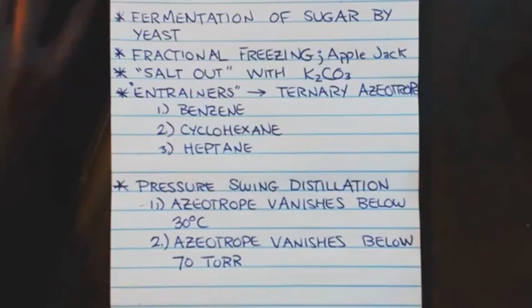No matter, you got to really put pressure on it. So you're not suppressing them at the same rate. A higher boiling point compound will be suppressed even more, a bigger percentage than a low boiling component. But that isn't the case when I read about individual, because this one has the low boiling ethanol and the high boiling water. Some books say, I mean, all books actually say that you just put a vacuum on it. I don't understand. They're contradicting.